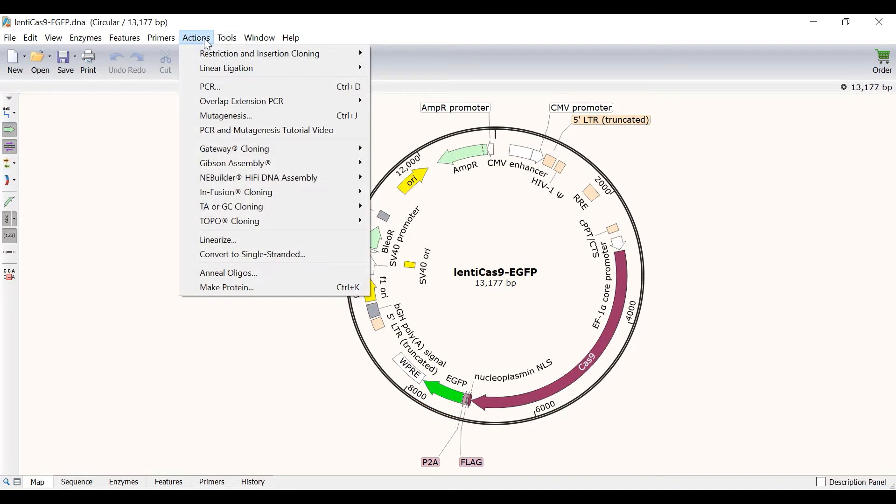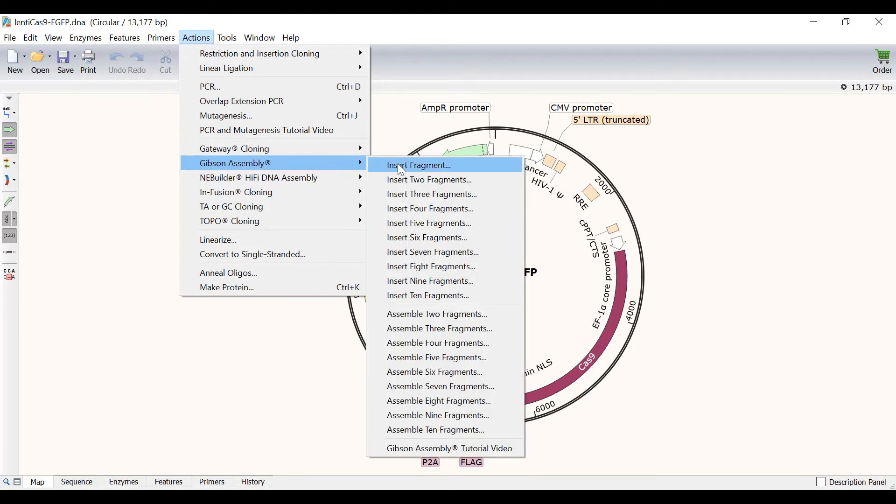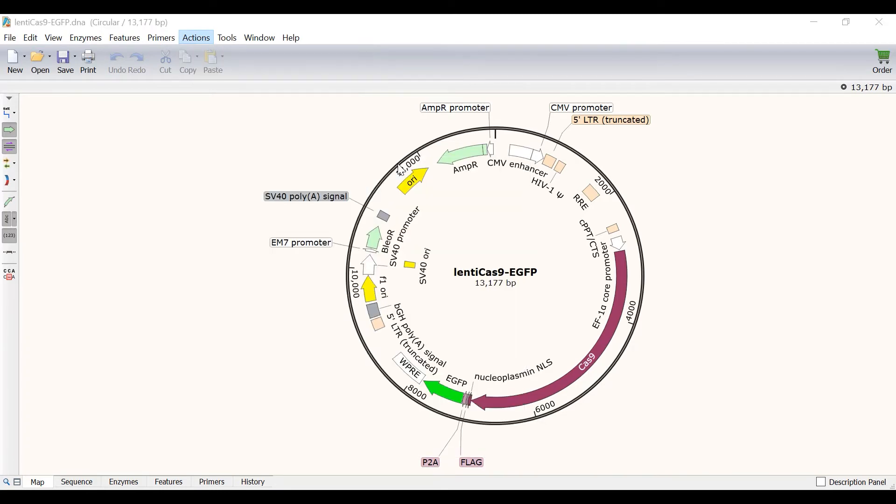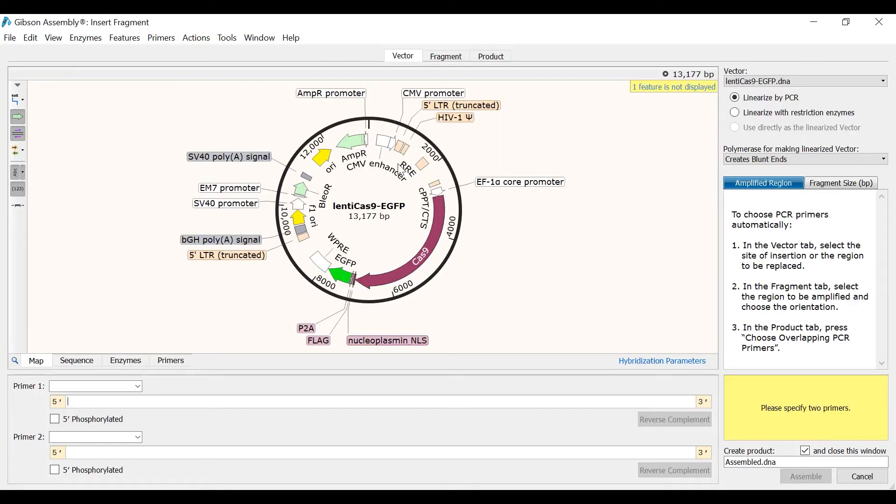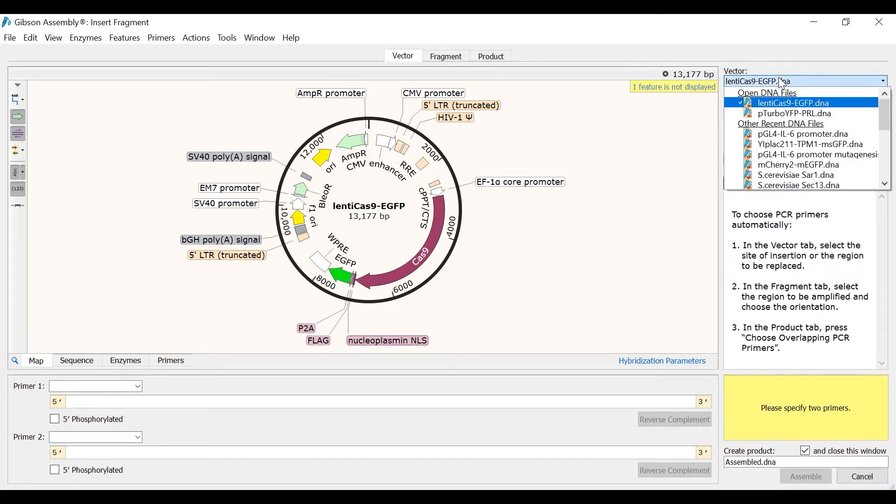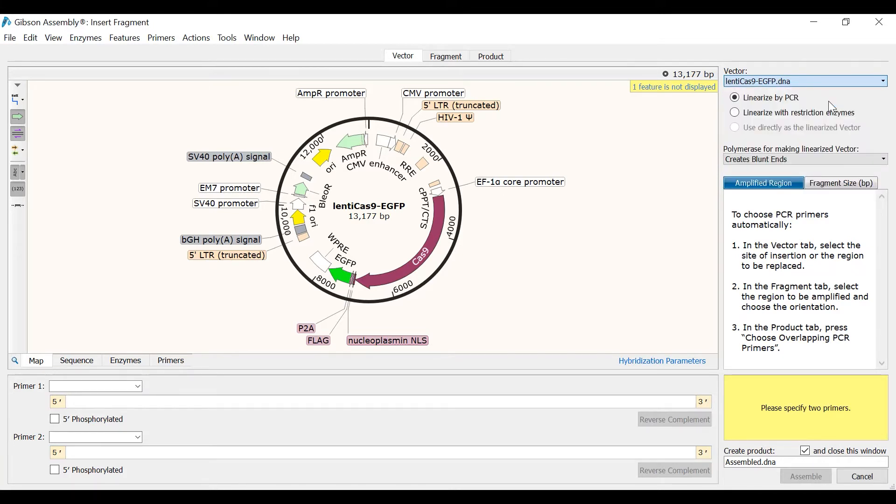I will go to Actions, Gibson Assembly, and then Insert Fragment. In this first tab called Vector I need to select the file containing my vector. I can do this by using the dropdown menu to the right. Since the Lenti Cas9 EGFP file was active when I chose the Gibson Assembly command, this file is automatically selected as my vector.